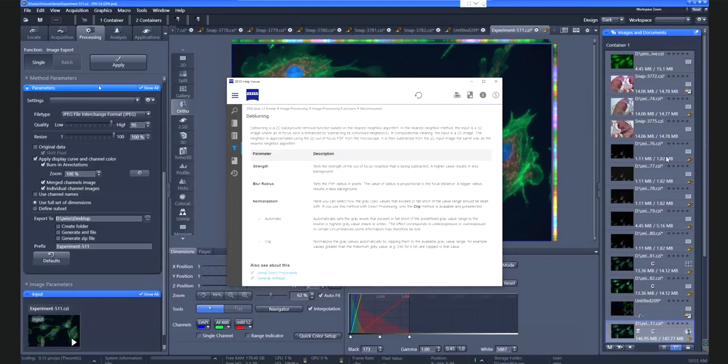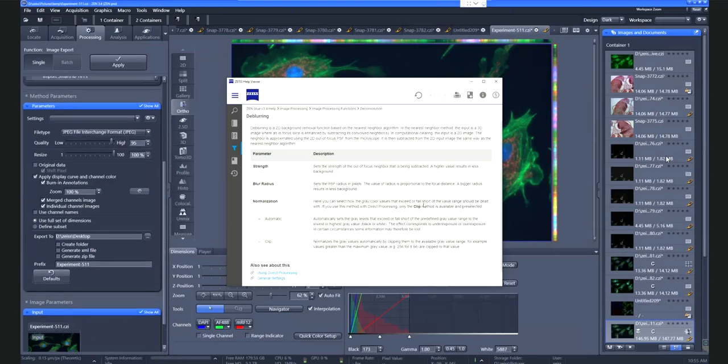Okay, so at least this refers to the processing. So I hit this help button here, and then I clicked into one of the options coming with processing, and you get referred to this image processing functions. Okay, super. Thank you.